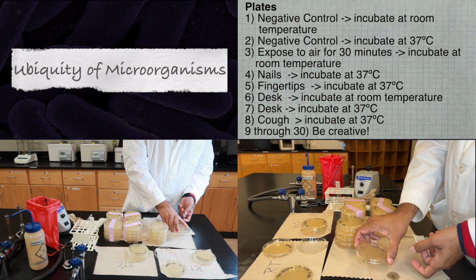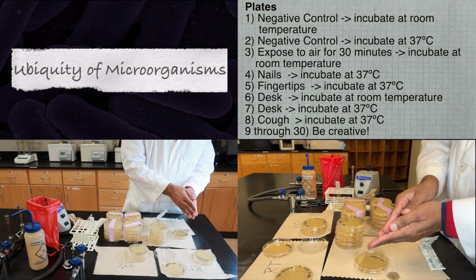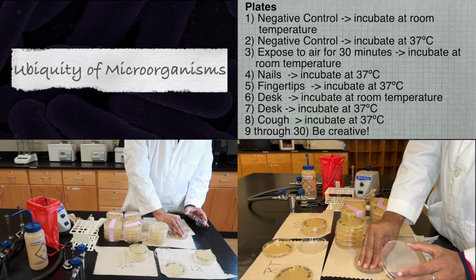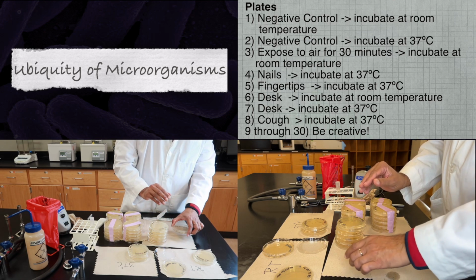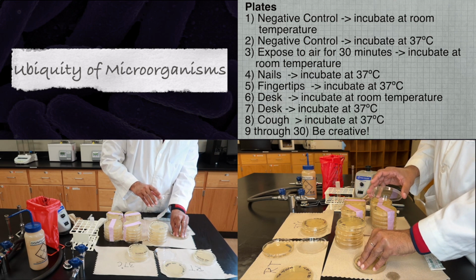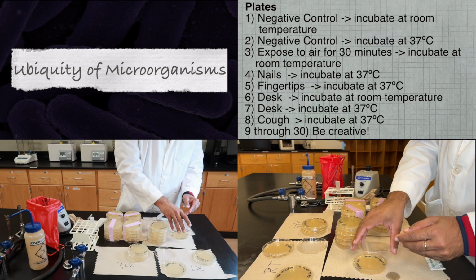For plate number 5, another student will rub their fingertips together and then proceed to touch the agar plate with their fingertips. This plate will then be incubated at 37 degrees Celsius.